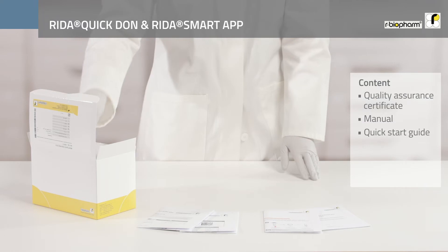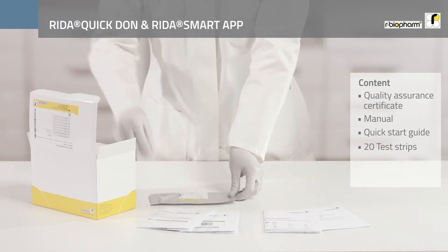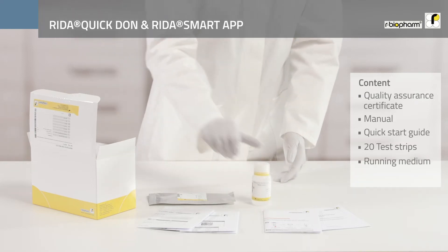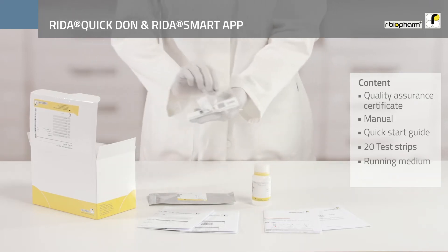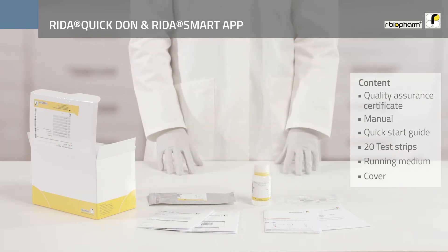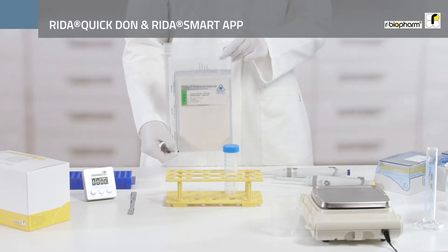The further components are 20 individually packed test strips, a vial of running medium, as well as a RIDA Smart App cover for the analysis of the test strip with a RIDA Smart App.